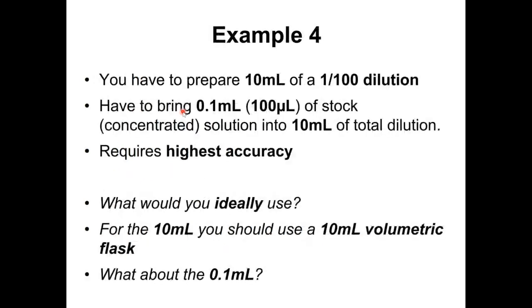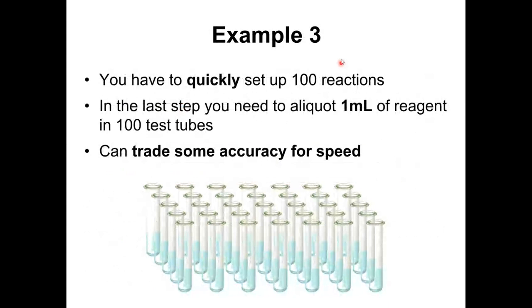For example, in this scenario here, if you have to set up this 100 reaction, so you will need roughly 100 milliliters here to transfer in this test tube. So you go to the original bottle of the reagent, and you would transfer roughly 100 milliliters into a beaker, right? The beaker has a 5% error. So even if you get a bit higher, 105, or you aim actually a little bit higher, even if you're higher than 100 milliliters, too bad. But at the same time, just transfer to the beaker so you don't go inside the stock bottle, the original bottle, with the risk of contaminating it.